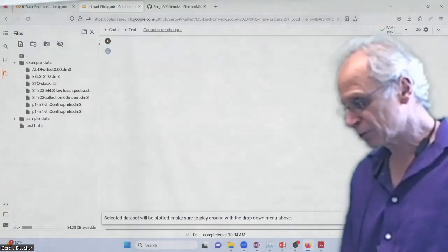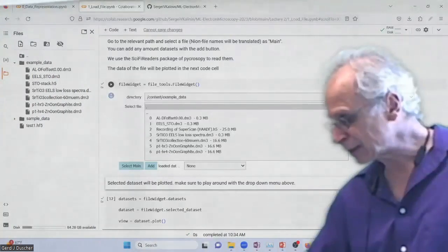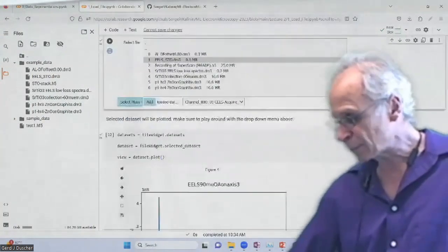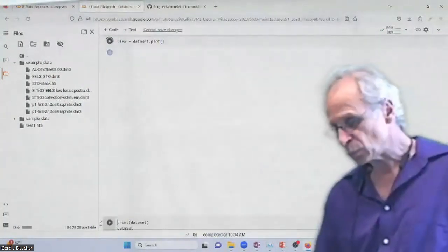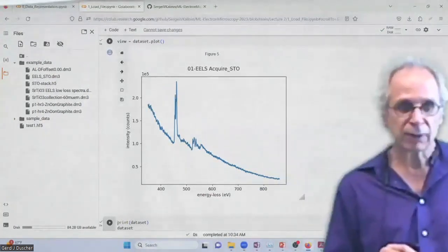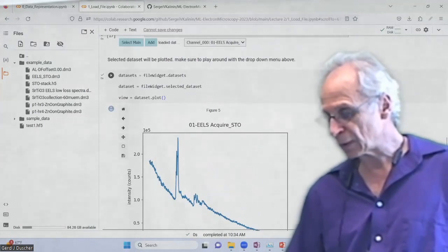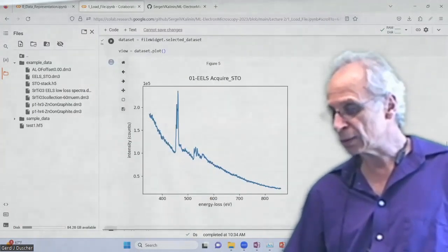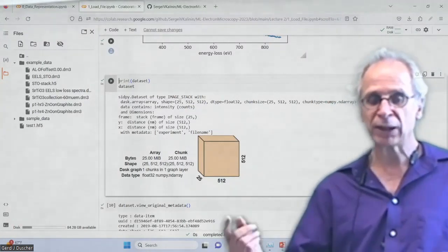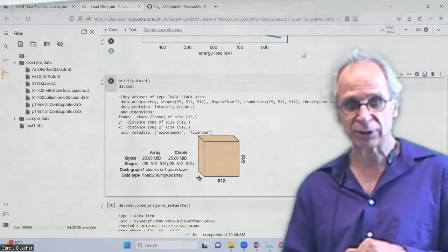Okay, I detected a bug here. So let's restart that part and go to EELS, and we select main. And then we have a different data set, right? So we have always the same name, but it might be different from whenever we did that. So we have to keep track of that ourselves.